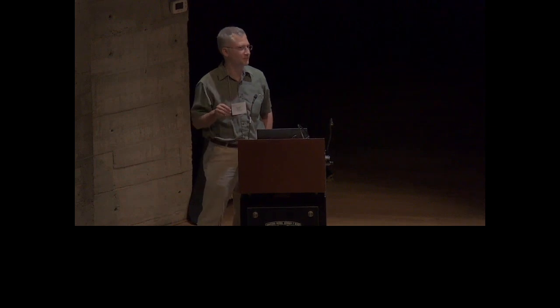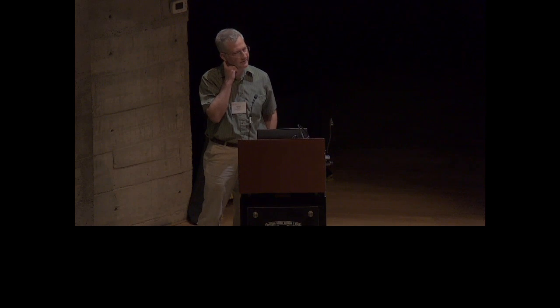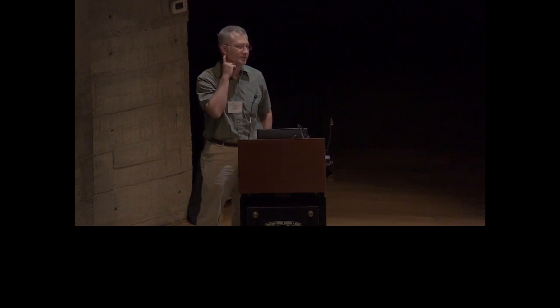Okay. Yeah, so I haven't gotten around to trying UMAP with this data yet, but it should be relatively simple to just replace inside the function. And I would be interested to see how they're different. In my experience with single cell, just looking at a t-SNE or UMAP, I couldn't tell you which was which in a lot of cases. But you're right, they are quite mathematically different.